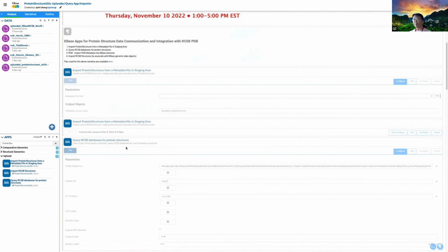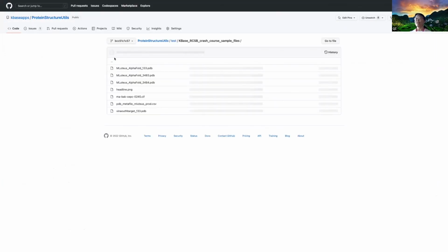Before the presentation, I had to upload the data into my staging area. If you wanted to follow along, because this narrative is public, you may want to preload those data. I put that link at the top of the document.